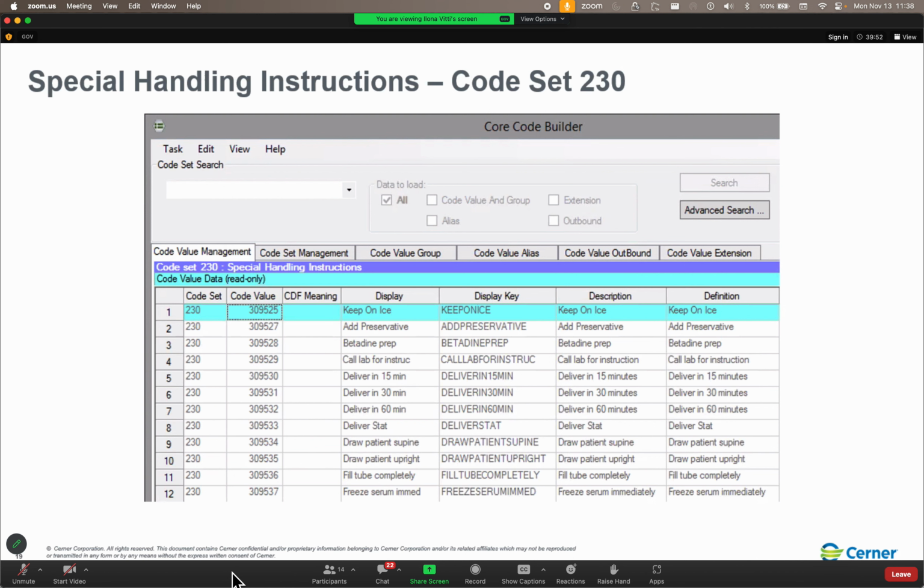But remember what I was talking about this morning in our workflow activity, that in addition to the ordering provider, order communication type, and order date and time, the lab share portion of the order server required 4 additional fields: specimen type, collection priority, reporting priority, and the collection date and time. The specimen type that it's looking for must be on code set 2052.